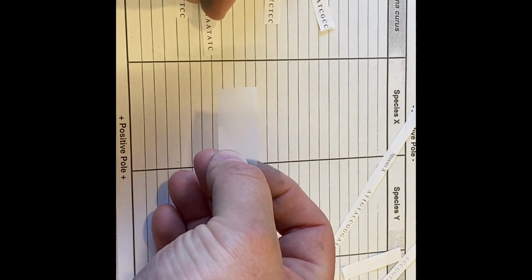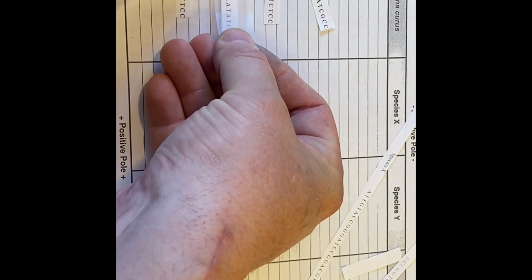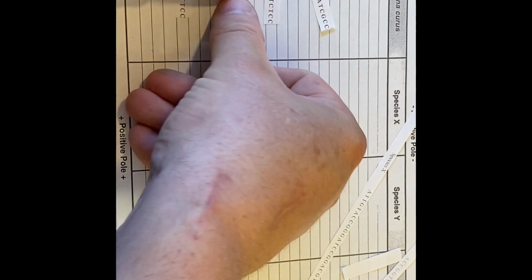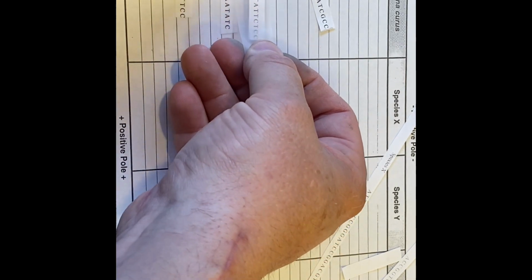I've done this lab enough to know that the next section has 9. Okay, and if you want to sit there and count them out, you're more than welcome to. 1, 2, 3, 4, 5, 6, 7, 8, 9. So that will go right here. And then the last two are a bit longer, 11 and 12, I believe. Again, if you want to count it out, don't believe the old man that's been doing it for a long time.